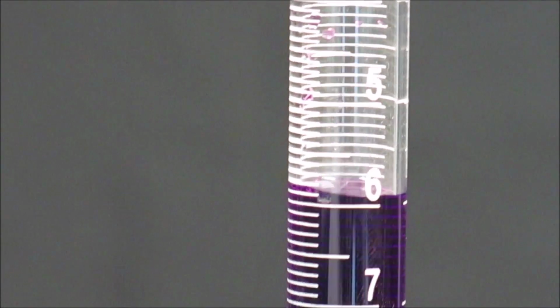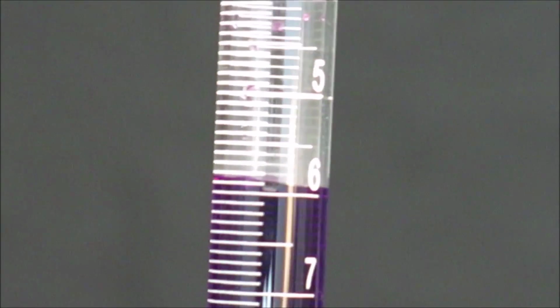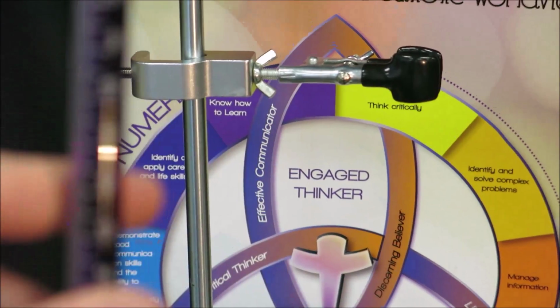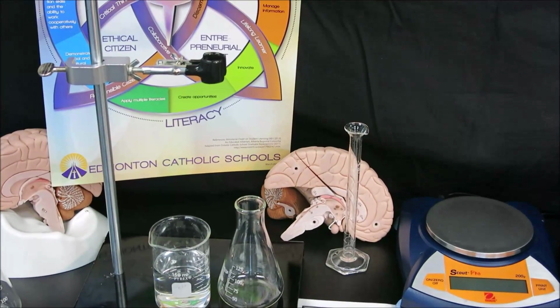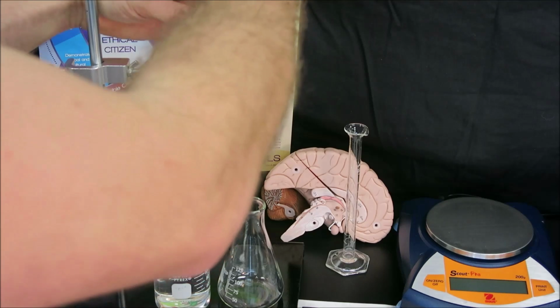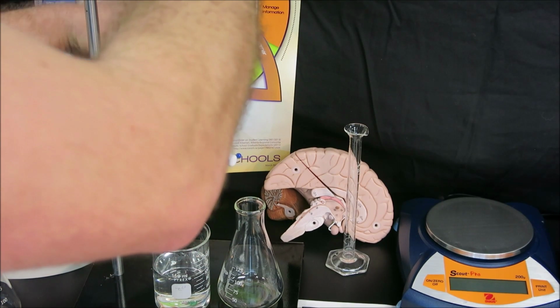For the remainder of the lab, I will verbally read the meniscus so as to avoid the difficulty of focusing. But remember that to fully achieve the accuracy required in titration, it is important to record right to the bottom of that meniscus. And then we place a burette into our clamps, and we are effectively ready to titrate.